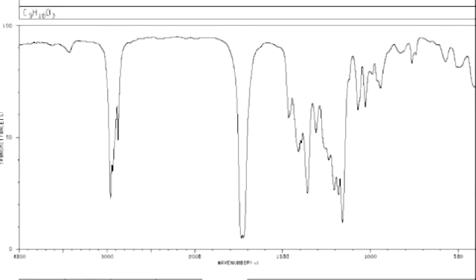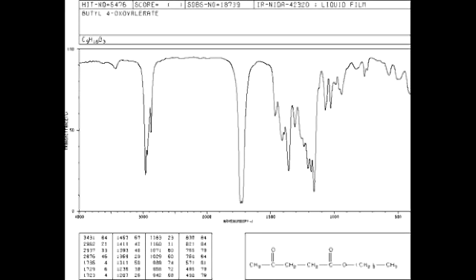Okay, and I think it's an ester because looking again around 1160 or around maybe 1080, I do seem to see a C single bond O stretch there. So looking at the molecule, it does in fact appear that we are correct. We do have a ketone and an ester. Another good thing to note here is, look at about 3400 maybe. That little peak right there, don't let that throw you off and assume there's a nitrogen in the molecule. Anomalies like that do happen from time to time, as long as they're small.